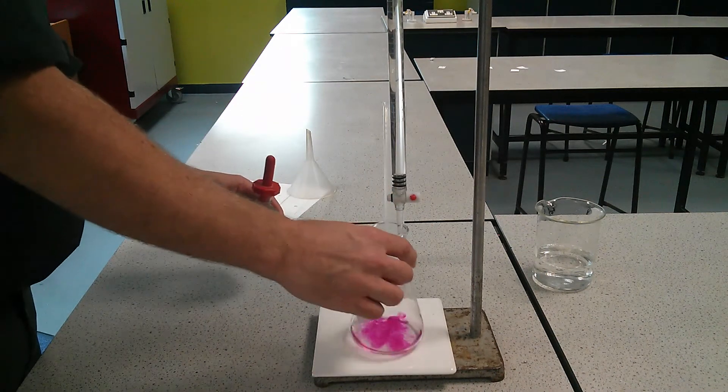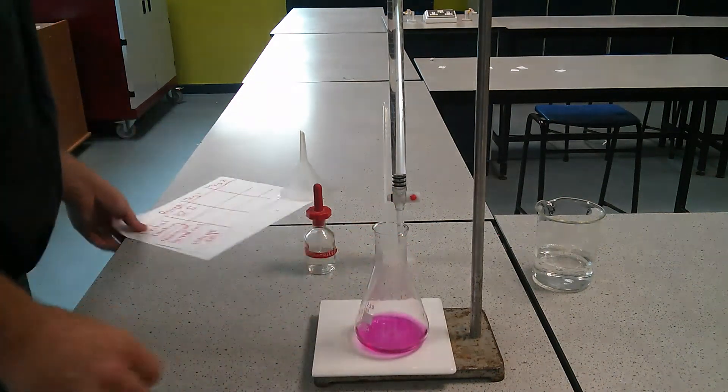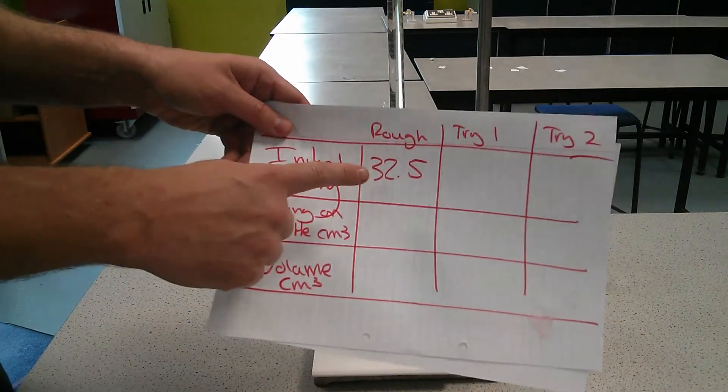And as you can see, it's gone purple. Our initial reading, or our rough reading, was 32.